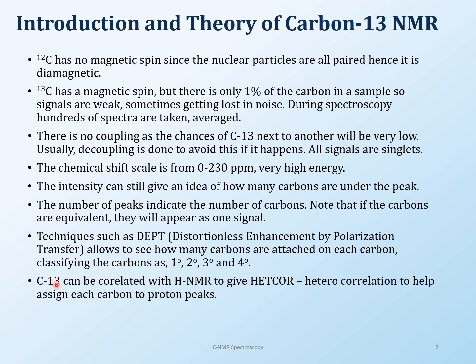There are some other techniques that we use in carbon-13 that can help us a little bit, and one of the most important ones is DEPT. You can read this all yourself. What DEPT does for us is it separates the carbons into primary, secondary, tertiary, and quaternary, which is a great help. Because if you're looking at all singlets, then you don't really know which carbons we are talking about. Just separating them into primary, secondary, and tertiary helps a lot, because at least you know how many hydrogens are attached to that carbon.